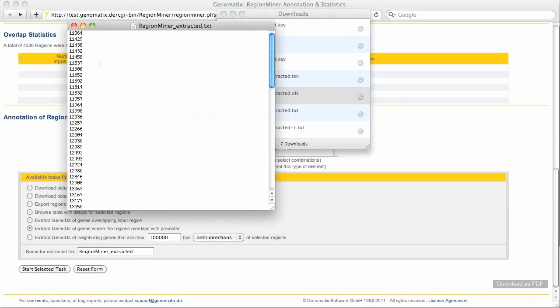Here is the list of gene IDs. To find out how you can learn something about the biology of these genes, please watch the GeneRanker tutorial on this website.